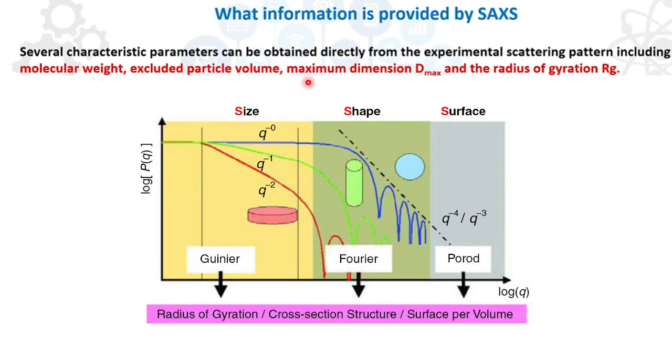Okay. So through SAXS, we can check different parameters of any sample. For example, what is the size? We know that size and shape are two different properties, because when different shaped particles are aggregated, they will take a different size. Okay. Now, what is actually measured here?